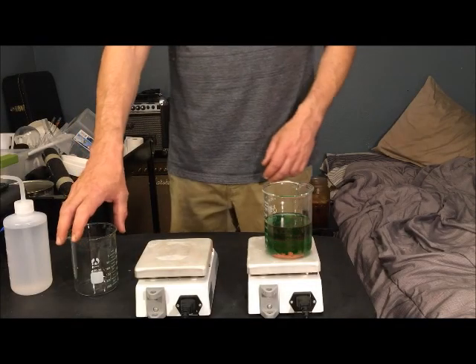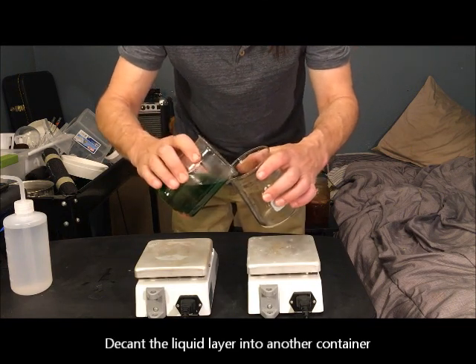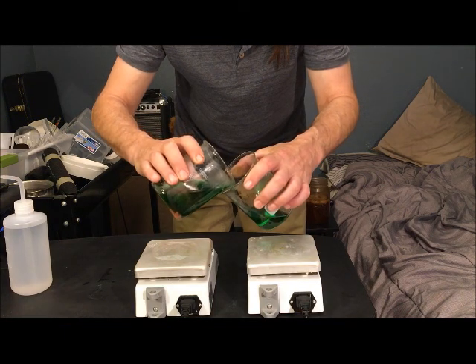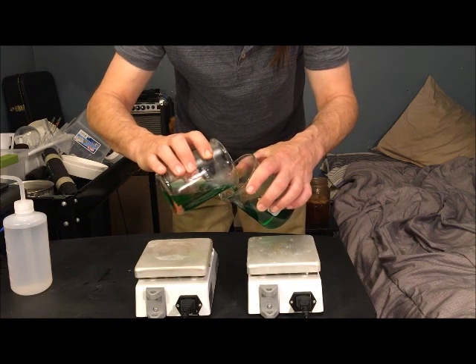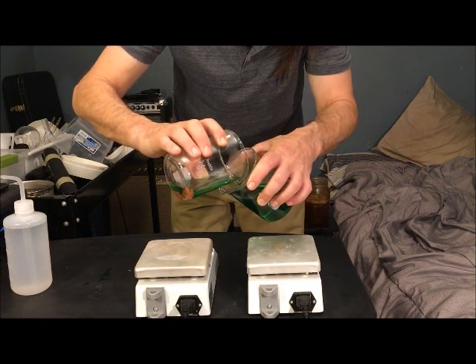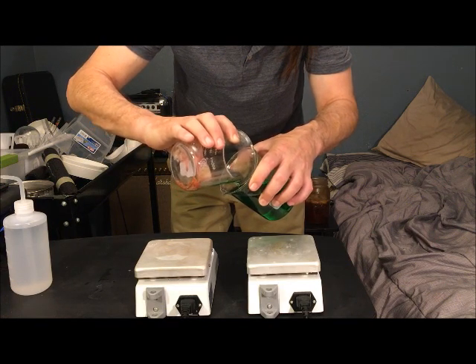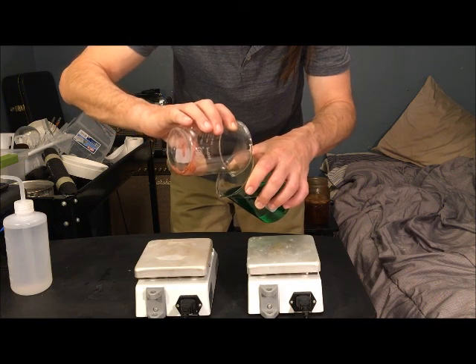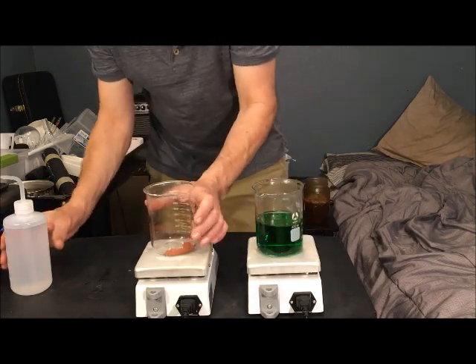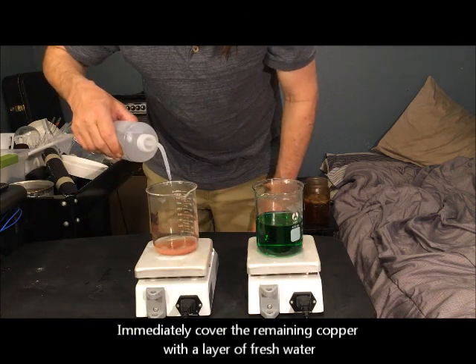Next we need to decant the liquid from the copper particles. Try to pour off as much of the liquid as you can into another container, being careful not to let any of the copper spill over. When you're done decanting, immediately cover the copper with a fresh layer of water. This will prevent the copper from oxidizing, which would render it useless.